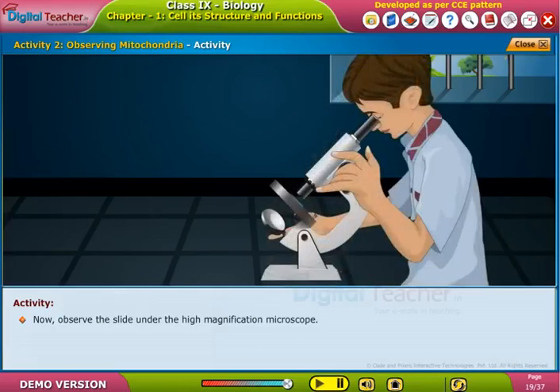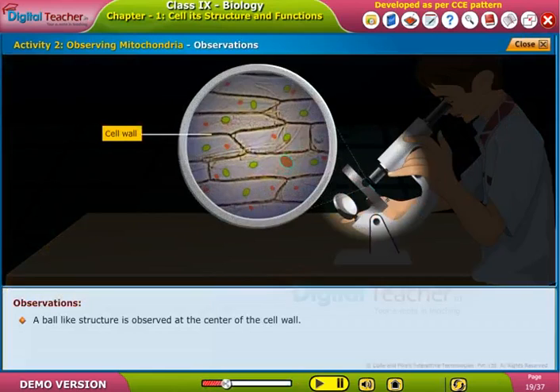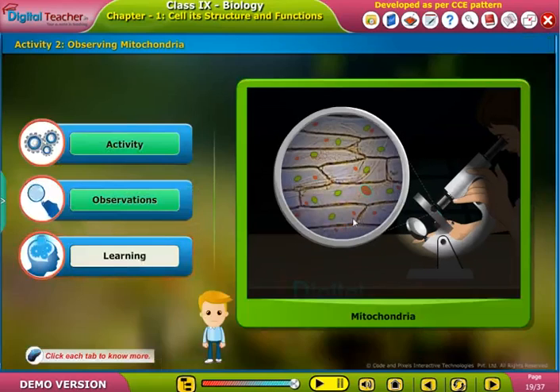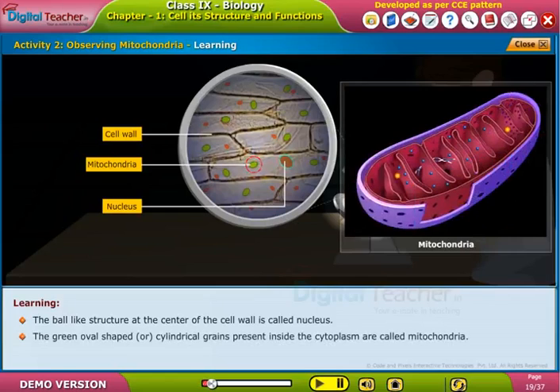Remove the air bubbles by pressing on the cover slip. Place the permanent slide mount under a microscope and observe the slide under high magnification. A ball-like structure is observed at the center of the cell — this is the nucleus. Green oval-shaped or cylindrical grains observed inside the cytoplasm are called mitochondria.